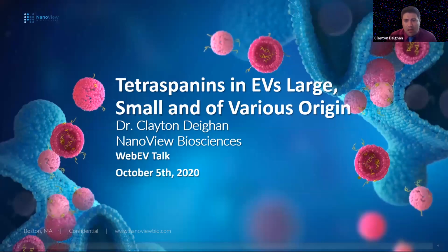So I'm sure many of you have seen my sales presentation, seen me come in and give a presentation about the technology. Today's talk, we're going to focus a lot more on the data. I'm going to be very, very brief with the underlying, how does it work, what does it do? And we'll approach it from the angle of, if we can detect individual EVs and we can analyze their biomarker content, what does that help us learn about the display of even common biomarkers like the tetraspanin family on EVs? And that's where I want to keep it today. So ask questions, get involved, see what you think, and we'll take it from there.